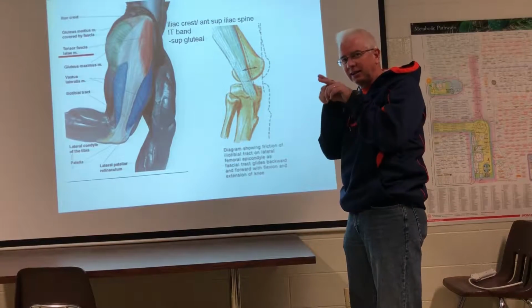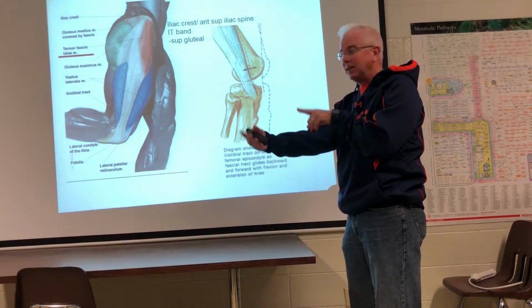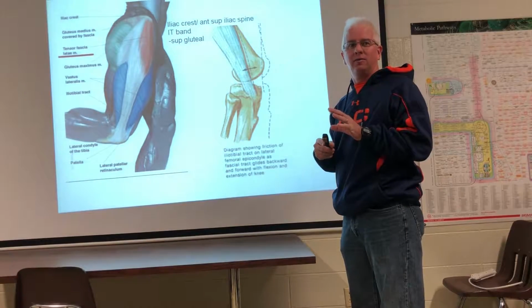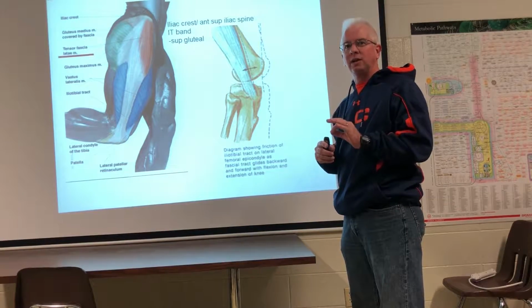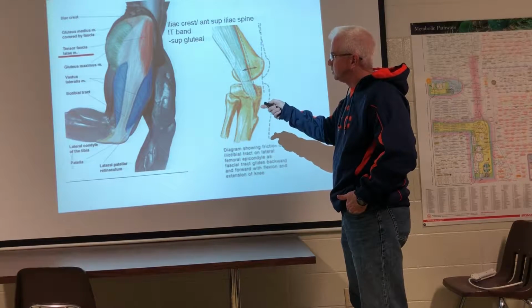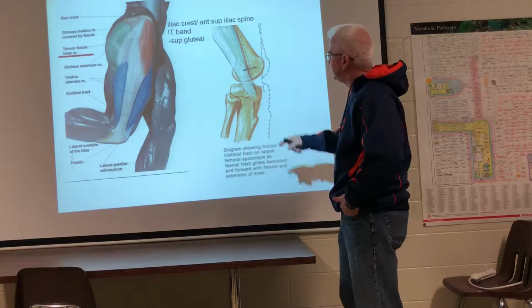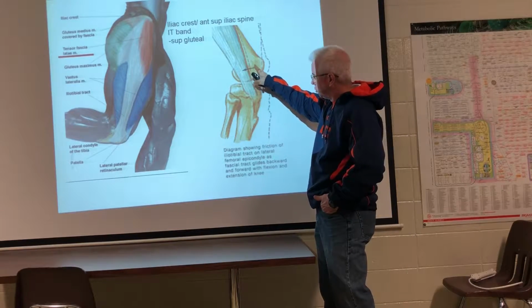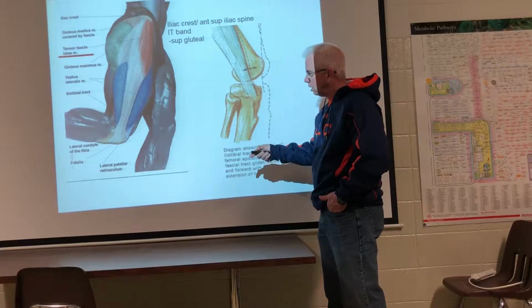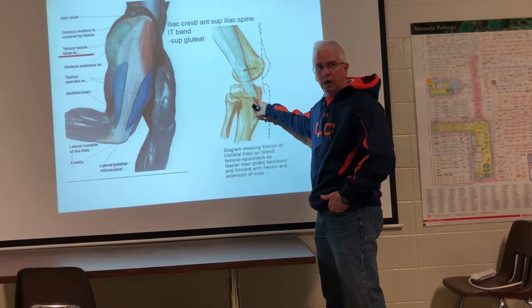Muscle. Now in your cat, it looks like a triangular muscle. And it's fused into that tendon, this tensor fascia muscle here. And it doesn't go very far. The color on the muscle runs out quickly. And then the rest of the muscle here, this tensor muscle, becomes this thick band that we call the IT band that extends down here, as you can see, across, it crosses over the lateral epicondyle of the femur and attaches to the tibia on the lateral side.